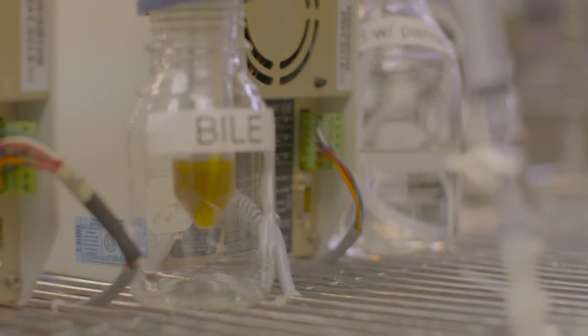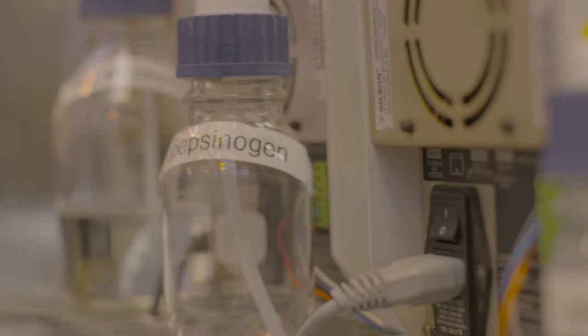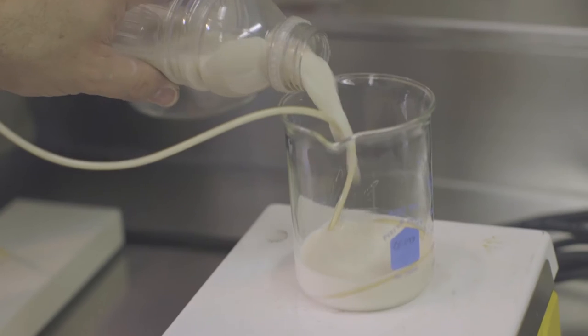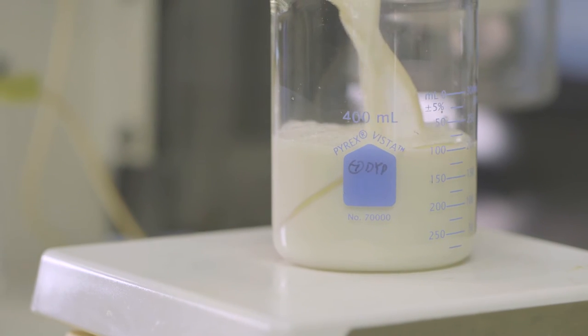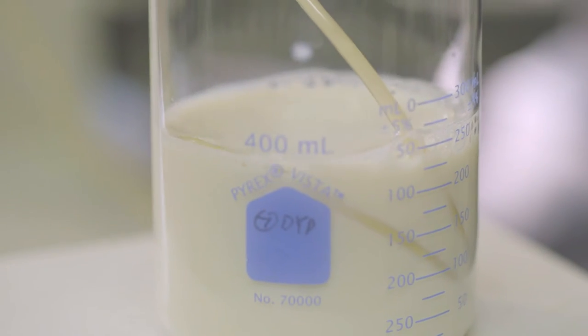Our system also produces different digestive solutions based on the type of eater and the composition of each element of the meal. The system therefore analyzes the stability of bioactive ingredients during digestion. All this is to understand the changes in the various food matrices.